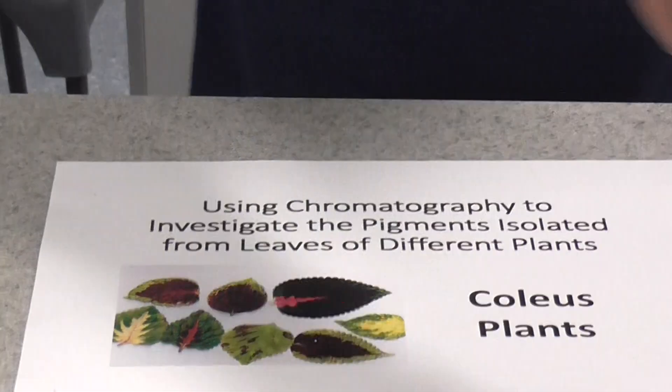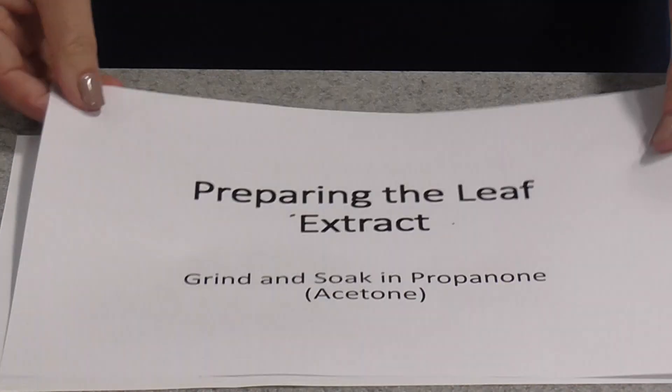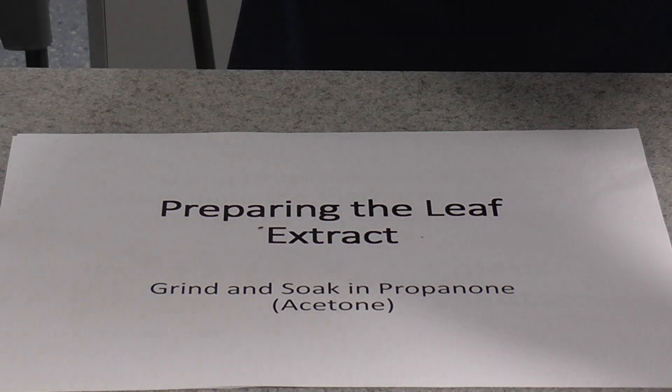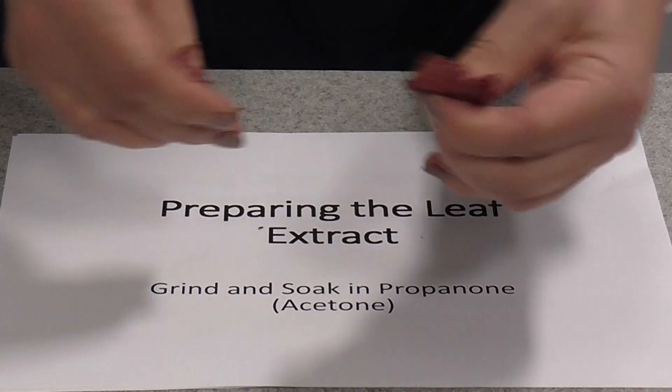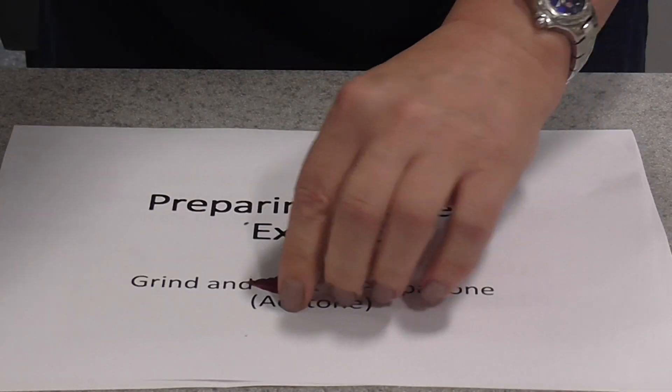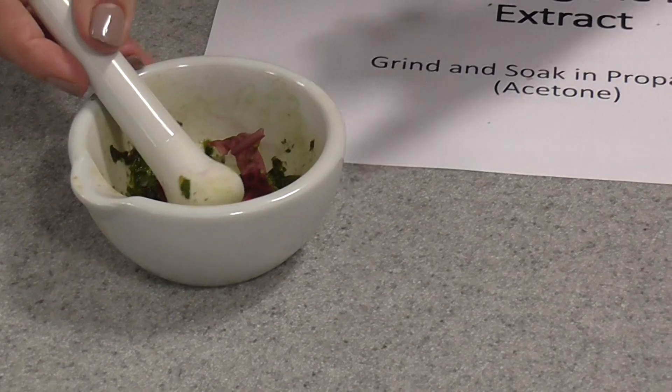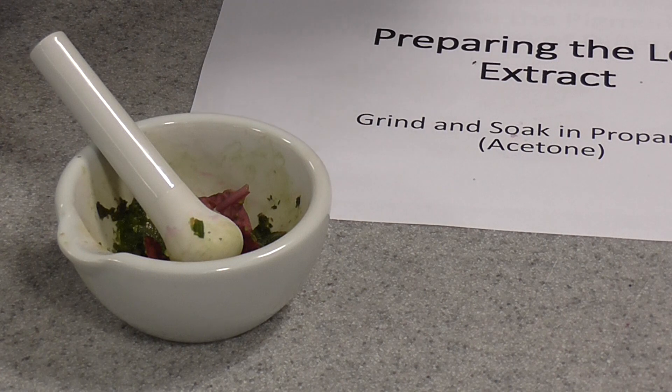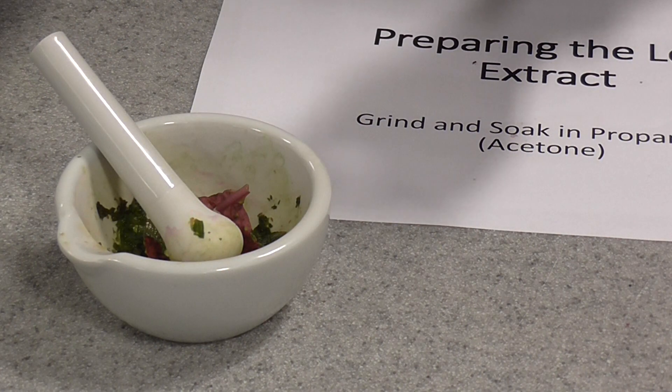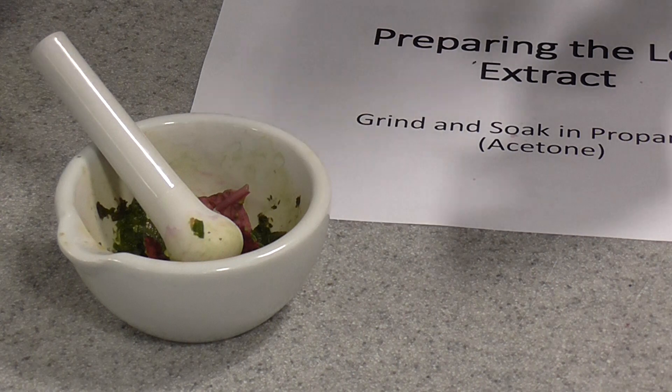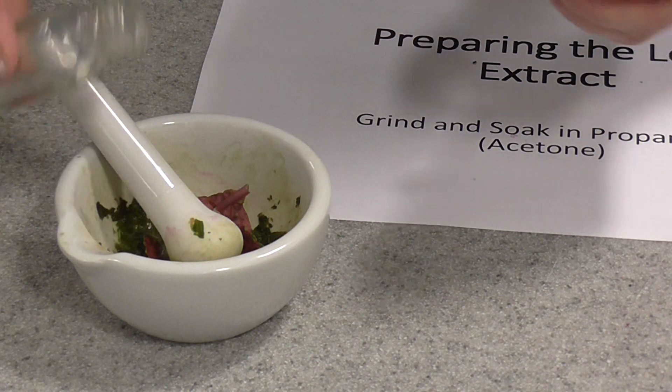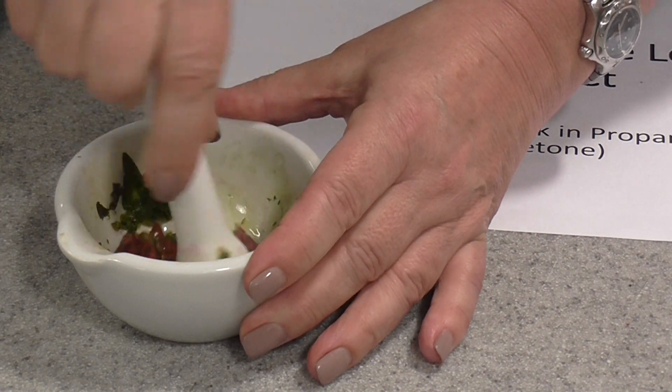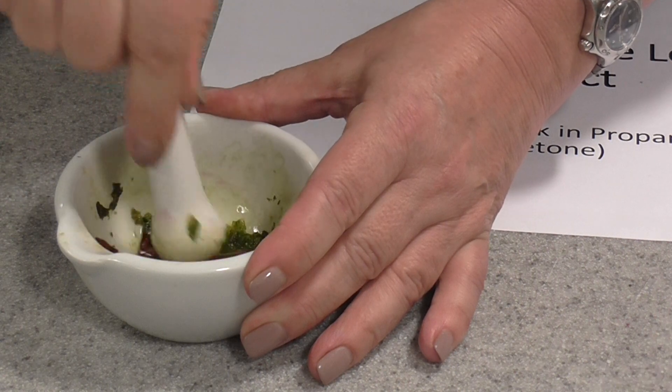The first thing you need to do is prepare a leaf extract. You're going to take a couple of little leaves off your plant, whatever you've chosen. I've got coleus leaves here. Tear them up and put them in a mortar. Now you can see I've already been doing this. It's a good idea to have just a pinch of sand. Then you need some solvent. The solvent for this is propanone, or in other words, acetone. Just a little bit. You don't want too much because you want a nice concentrated pigment extract. Grind your leaves up with the sand and the acetone.